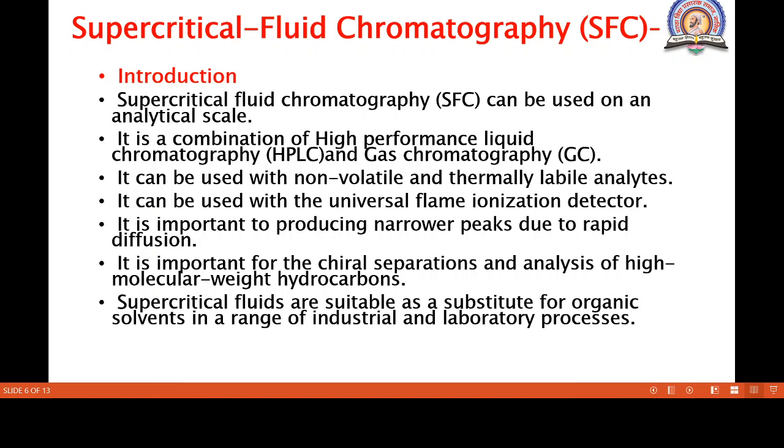That means this SFC is the combination of HPLC and GC. It can be used with non-volatile and thermally labile analytes. It can be used with the universal flame ionization detector. It is important for producing narrower peaks due to the rapid diffusion. It is important for chiral separation and analysis of high molecular weight hydrocarbons. Supercritical fluids are suitable as a substitute for organic solvents in a range of industrial and laboratory processes.